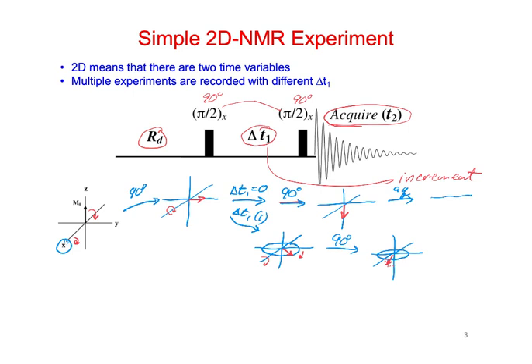It's down. So we're going to run our acquisition. And we're not going to really worry so much about the phase here, but just how much signal is in the XY plane, because we can phase it however we want. Okay? So what's this going to look like? A small peak. Okay, so we're going to see some small peak.